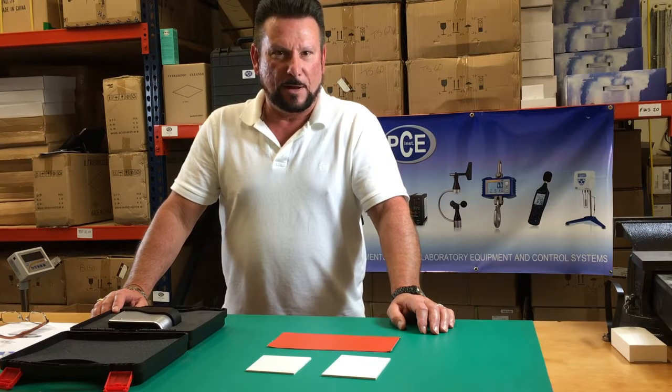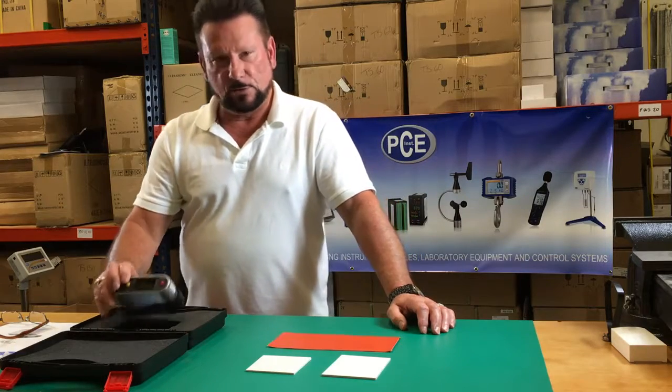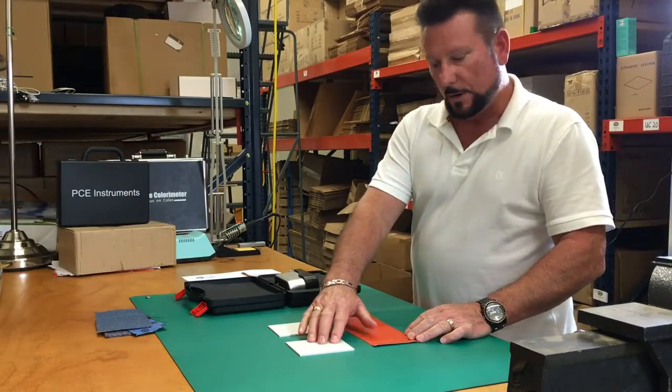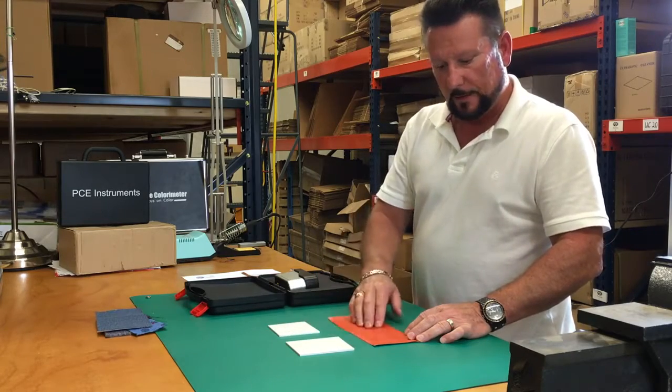Hello, my name is Donald. I'm here at PCE Instruments. Today I'm going to be demonstrating the use of the gloss meter PCE GM50. We're going to measure the gloss luster on these three samples. We have kydex and we also have vinyl.